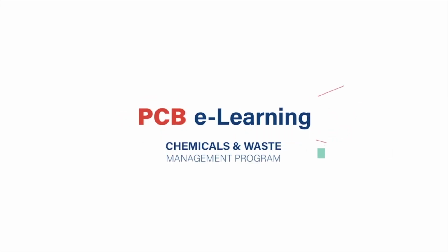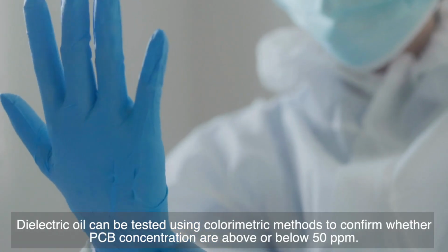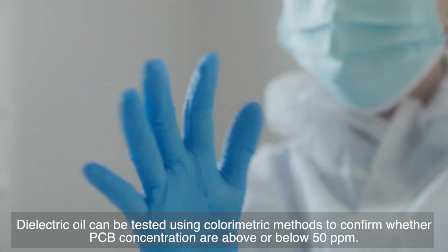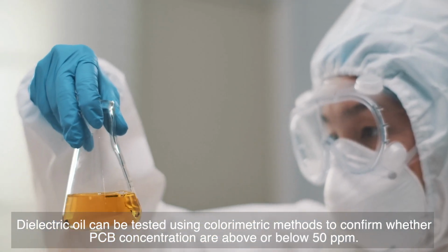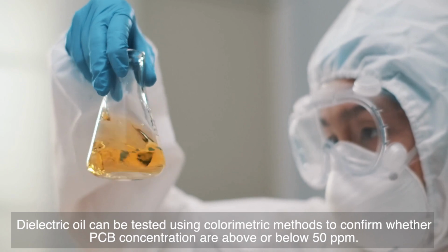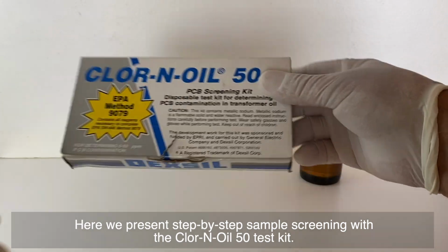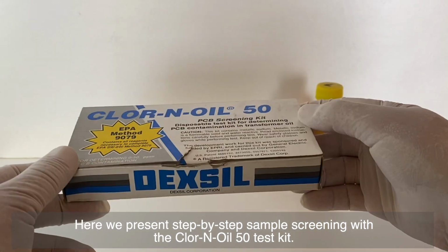Welcome to Unitar's tutorial on screening with a Clor-N-Oil test kit. Dielectric oil can be tested using colorimetric methods to confirm whether PCB concentrations are above or below 50 parts per million. Here we present step-by-step sample screening with the Clor-N-Oil 50 test kit.